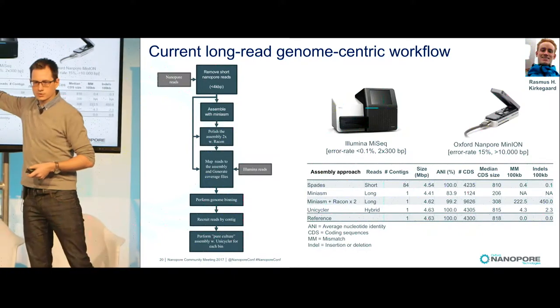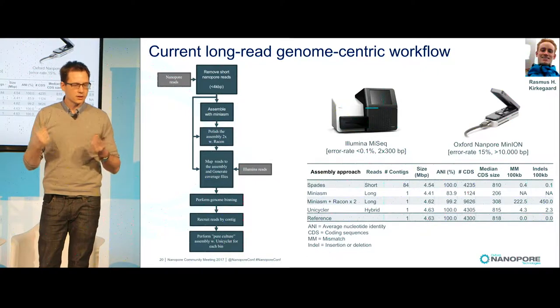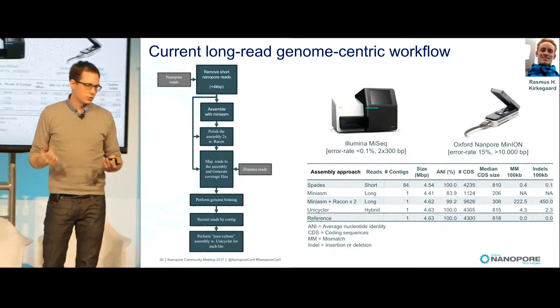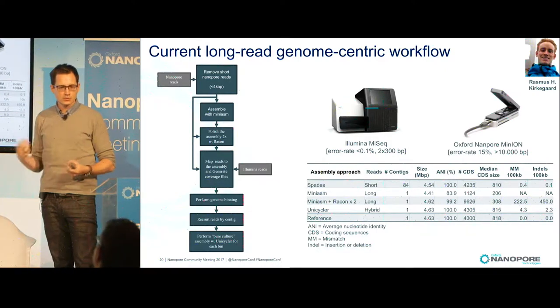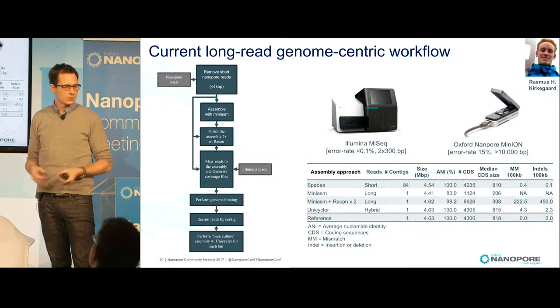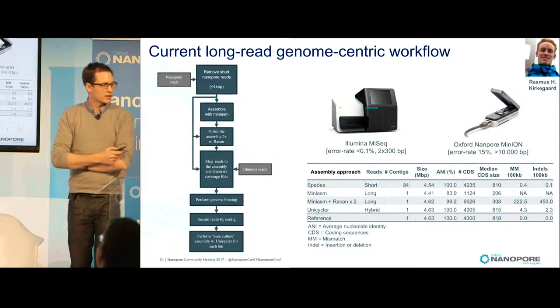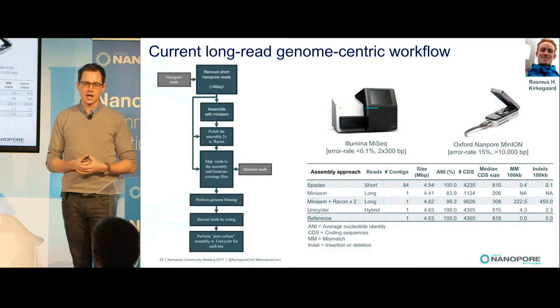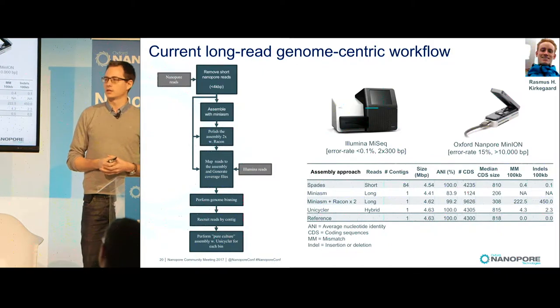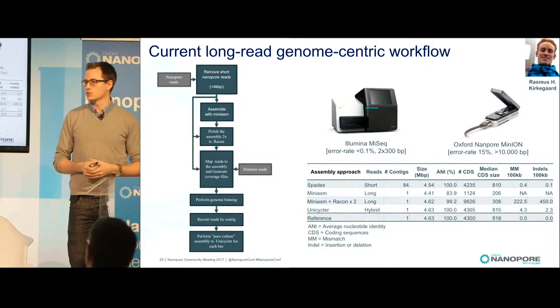So we go very fast from huge complex datasets: we assemble using miniasm, we do binning, and then we reassemble using Unicycler. That means you cut out the parts that are often difficult. It's difficult to use many assemblers on metagenome data, but using a naive, quick and dirty assembler makes it feasible. So it works better than expected, and currently we are exploring the impact of strain diversity. How much impact does that have, and where can we go from here to solve this? But we seem to be very close to high-quality genomes, even from complex samples using long reads.